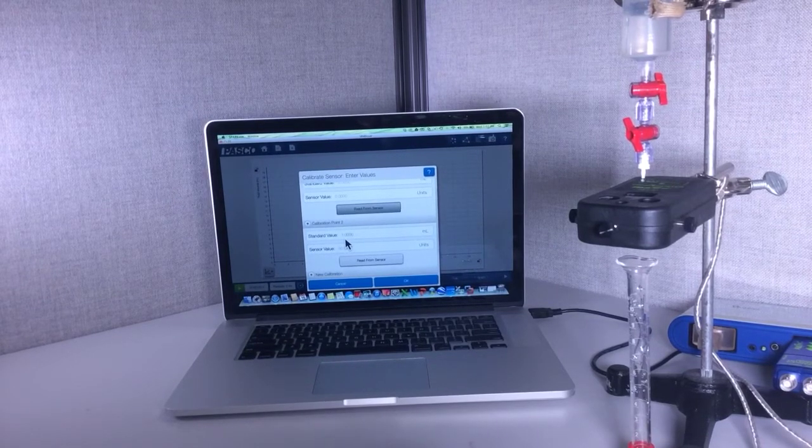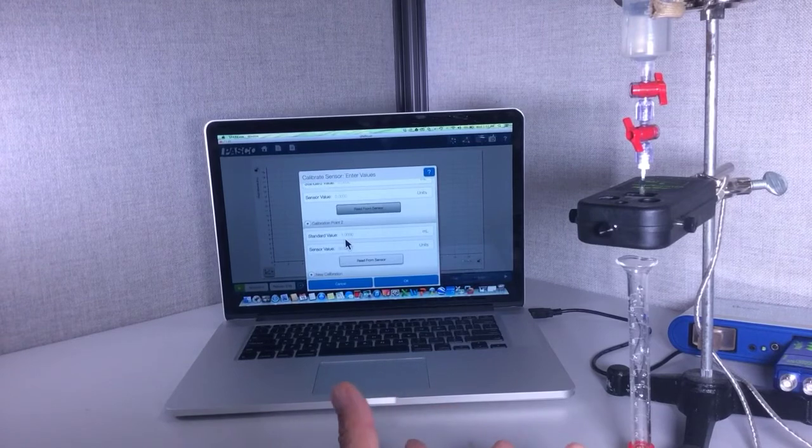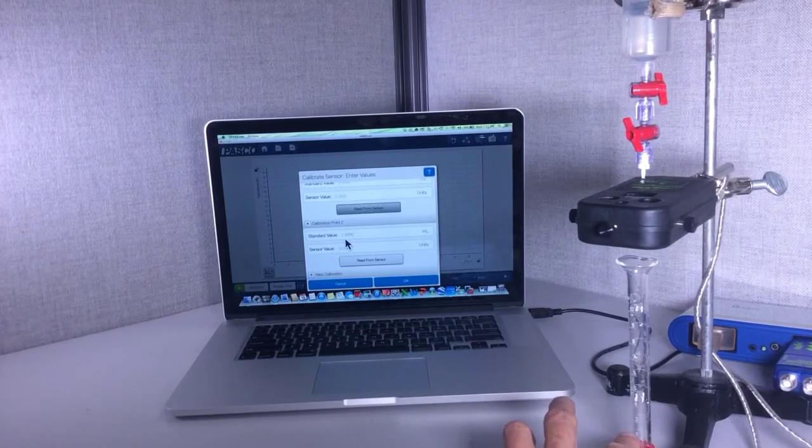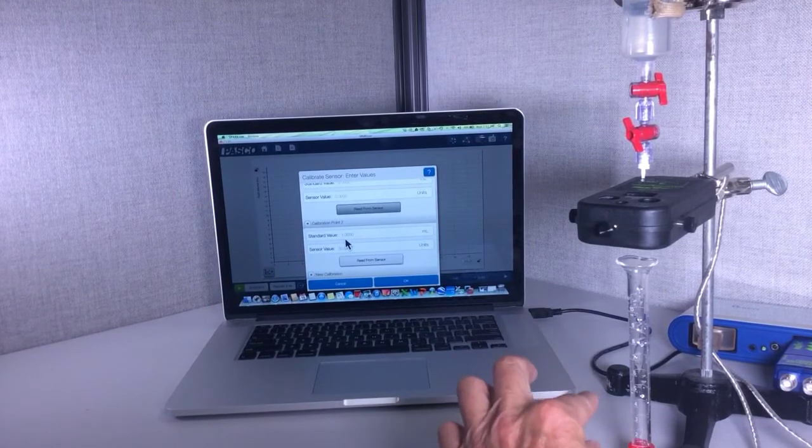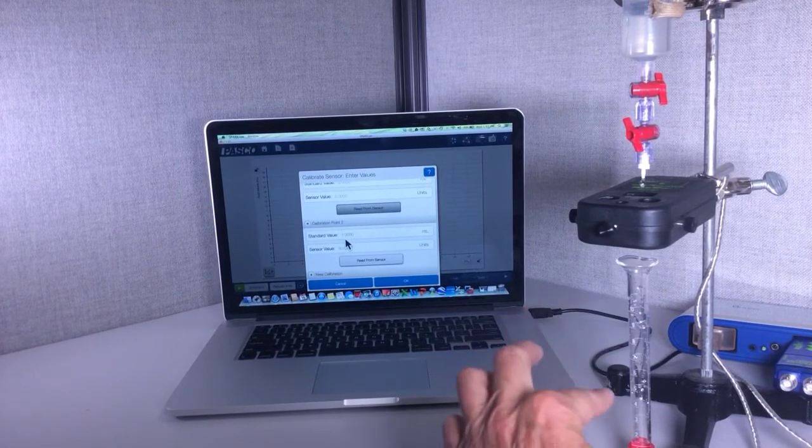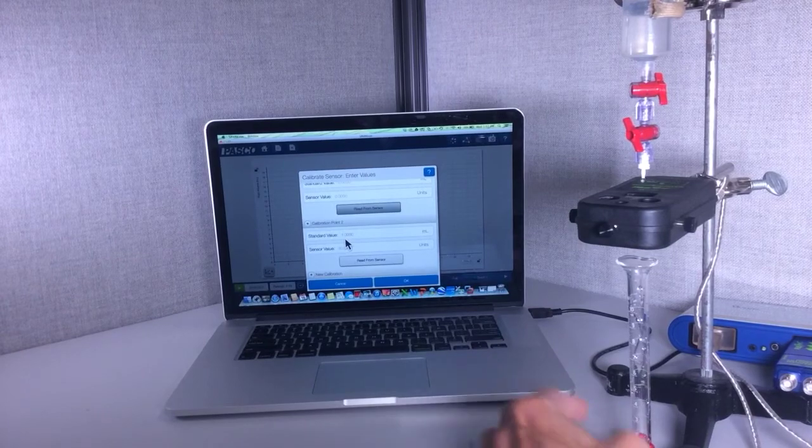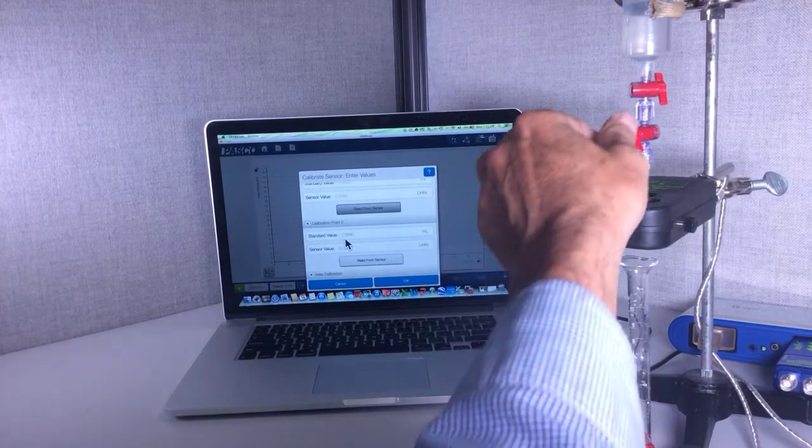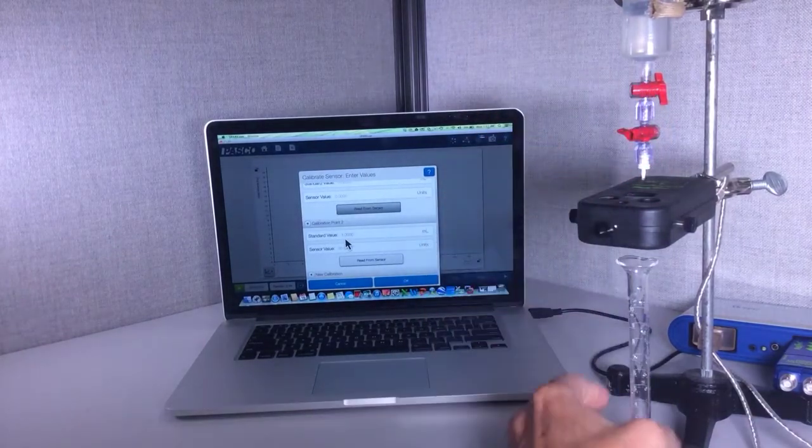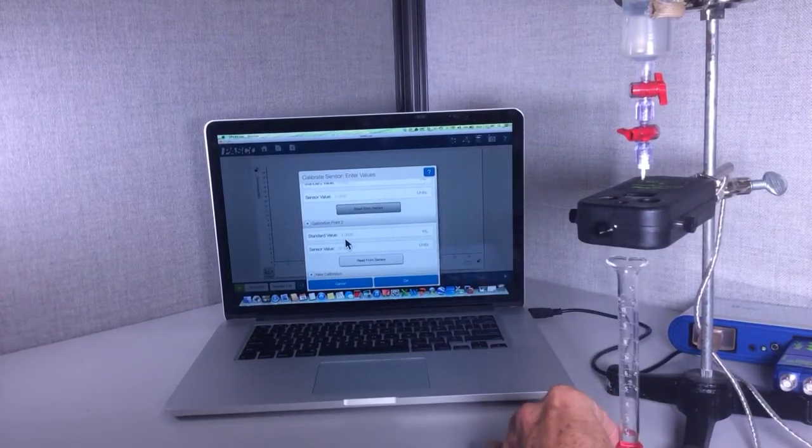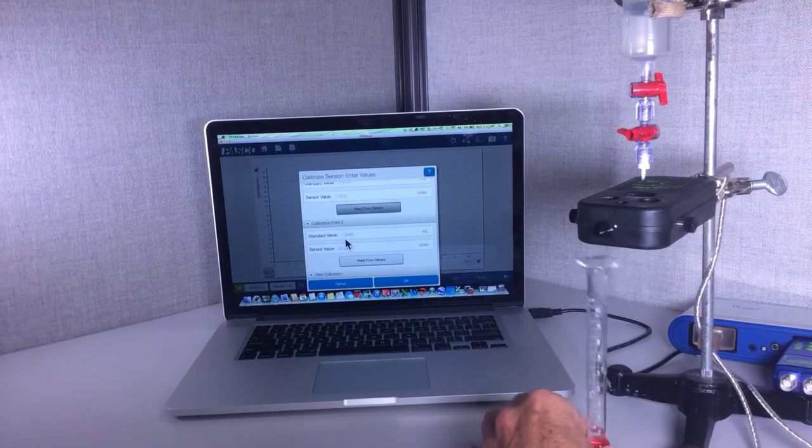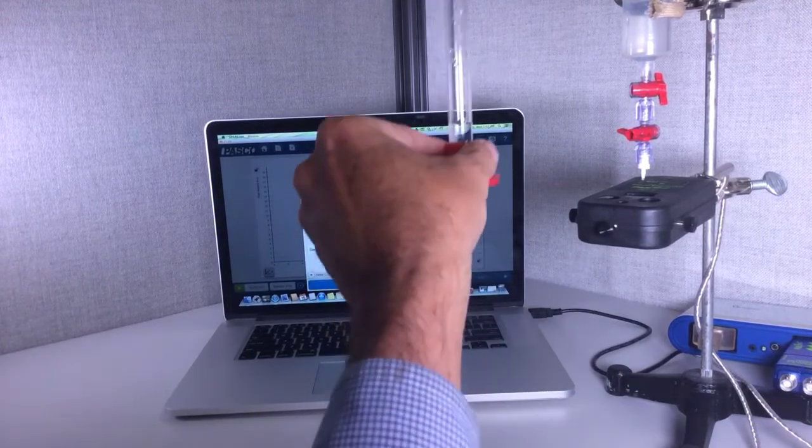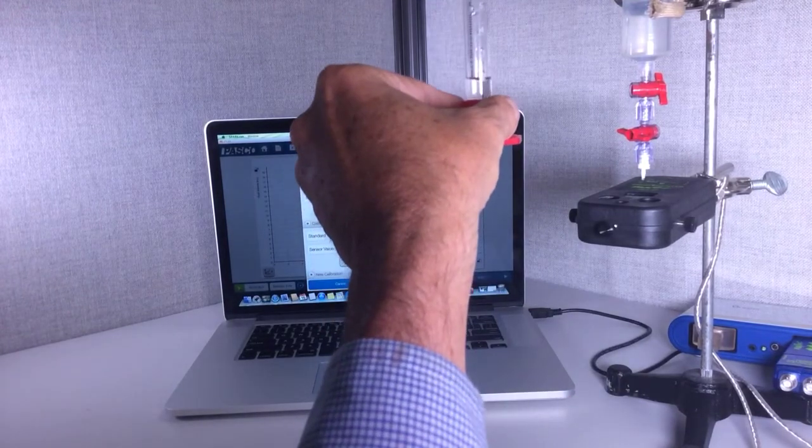What it's going to do once I collect enough volume, it's going to relate that to how many drops. So I see I'm closing in on two. I'm going to stop it there and it looks like I went to 2.1.